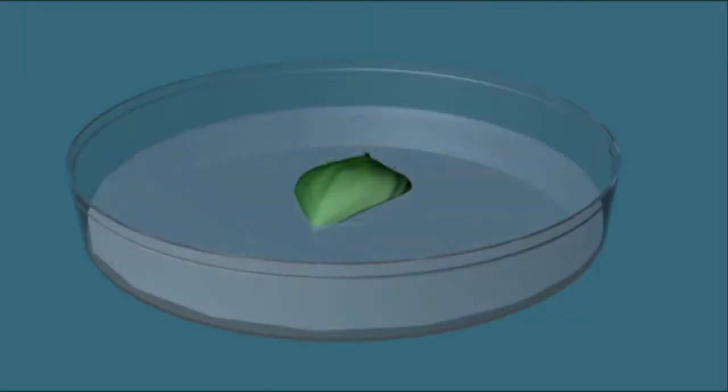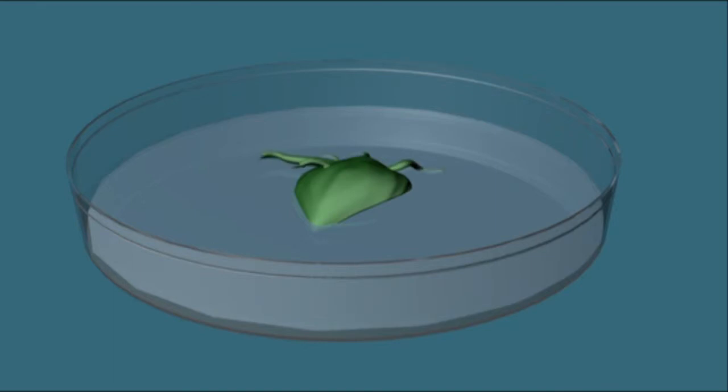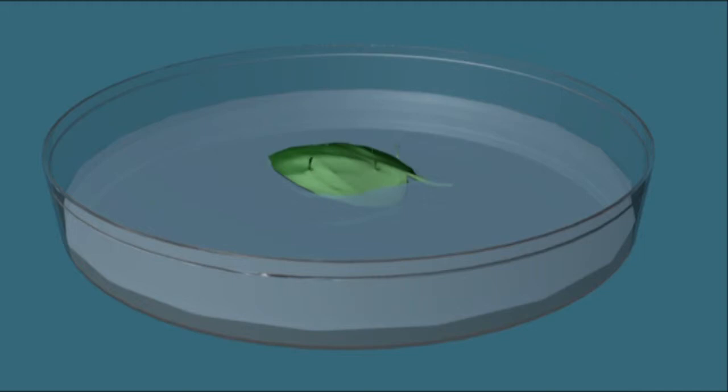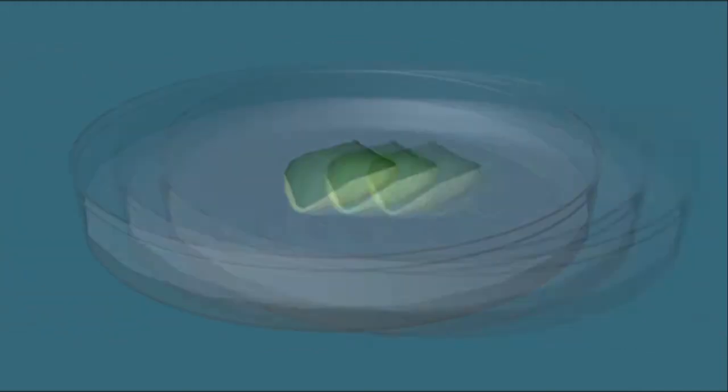Plates with only auxins in the media encourage root growth. Those with only cytokinins, shoots should form. And plates with both should result in callus forming.